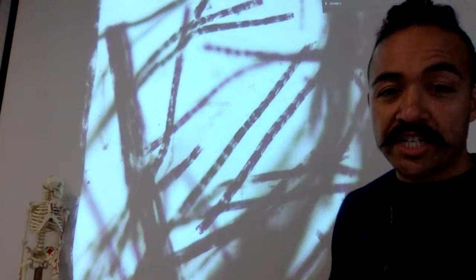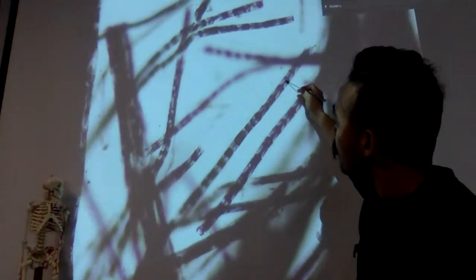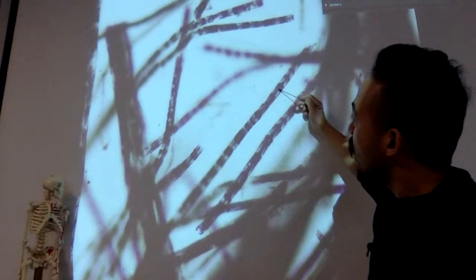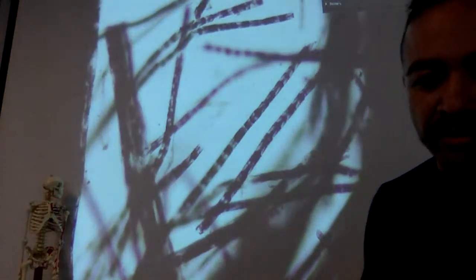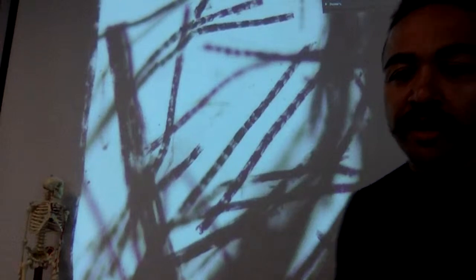So that's where you have a high concentration of those voltage gated channels. You can see the actual axon, this thin strip in the middle. This is the axon, the node of Ranvier, and these would be Schwann cells at every interval covering up, because this is a peripheral nerve, so those would be Schwann cells forming the myelin sheaths at those regular intervals.